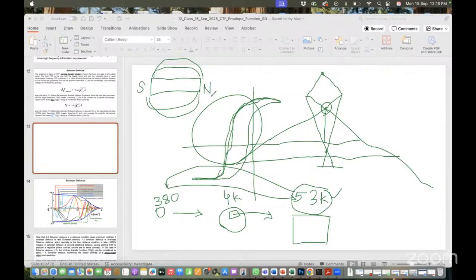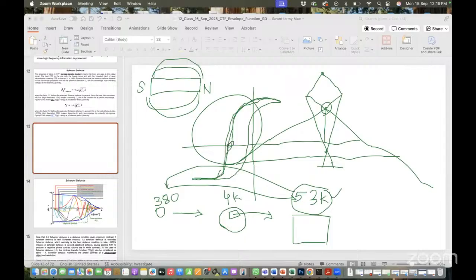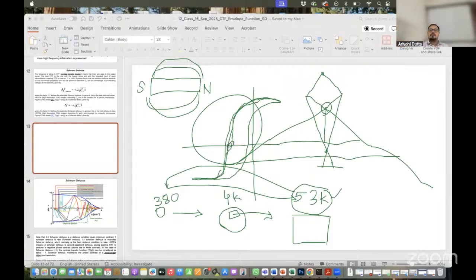So whenever you are inserting your grids or sample, if that is a problem, that okay, you are using soft iron or soft metal that is making your electromagnetic lens, and if you have the hard metal, it will take a little bit longer time, or you need external force to bring it down to zero. So it is always better whenever you are inserting the sample, you should not jump from very low mag to very high mag. So you just do these things gradually.